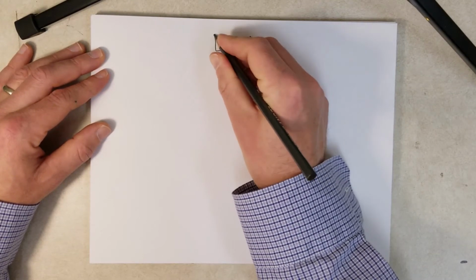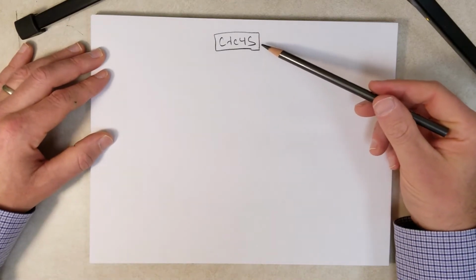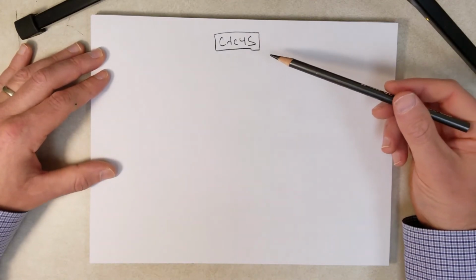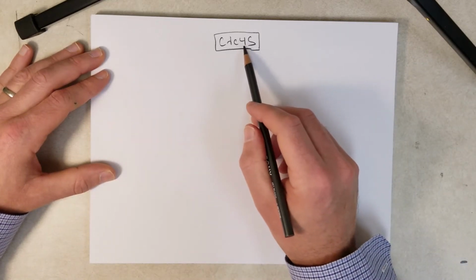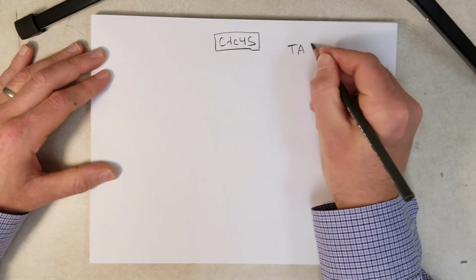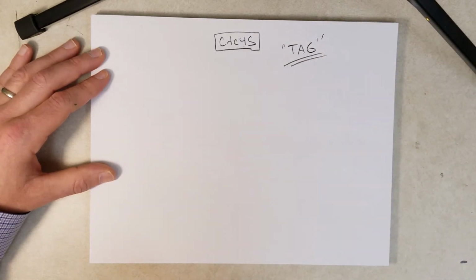Now, when we're studying initiation of replication, we would need to purify all of these proteins one at a time. And so the way we would do that is we would need to tag this. Tag is sort of a molecular biology jargony term. I'll explain in a moment what that means.